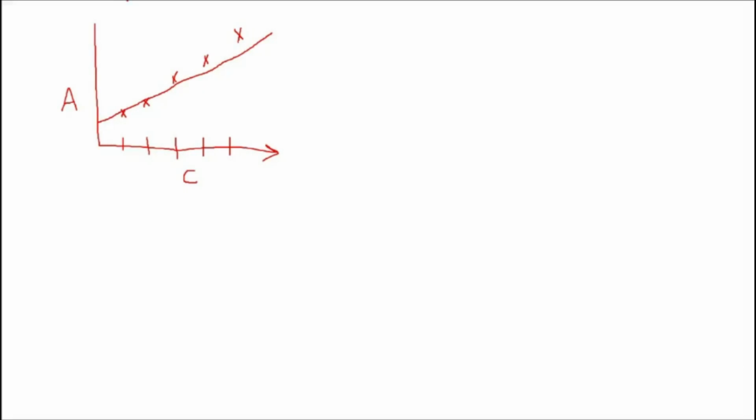The another point I want you to note that the points are not falling on the straight line. They are on the either side of the best fit line. What may be the reason why they are not on the line? It is the same paracetamol we are using for all the solutions, but still we are not getting proper experimental conditions. Ruksar, you are thinking on the right manner.